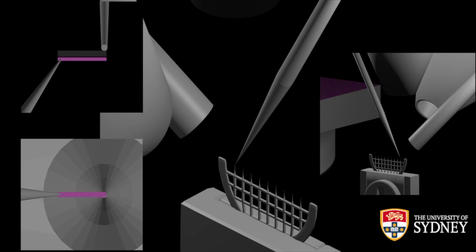Usually the micromanipulator and the stage are not perfectly connected in terms of electrical conductivity, and that can come in handy at that point, because you will see, in the ion beam view especially, the color or the brightness of the lift out piece change as soon as it touches. So as soon as it gets an electrical contact, and then you've touched and you've got good alignment there, you can start filling up the gap and attaching the lift out piece to the support structure.